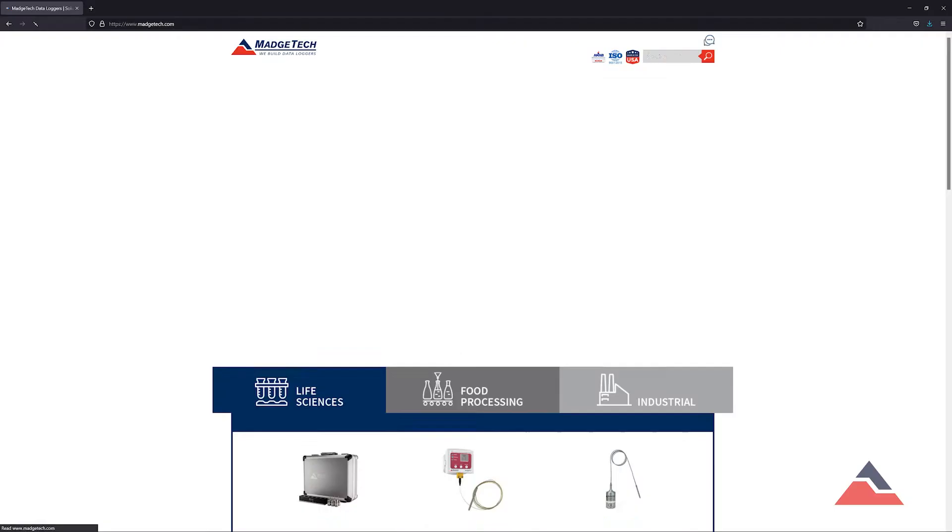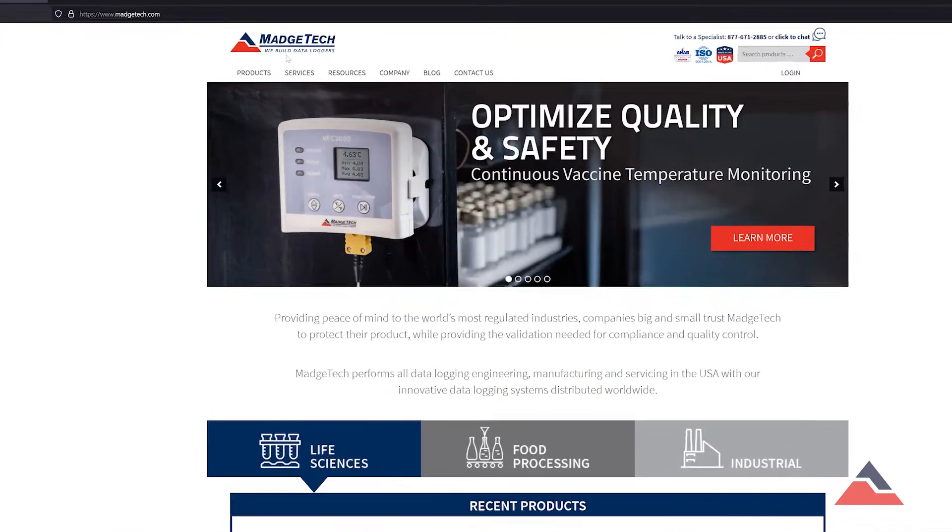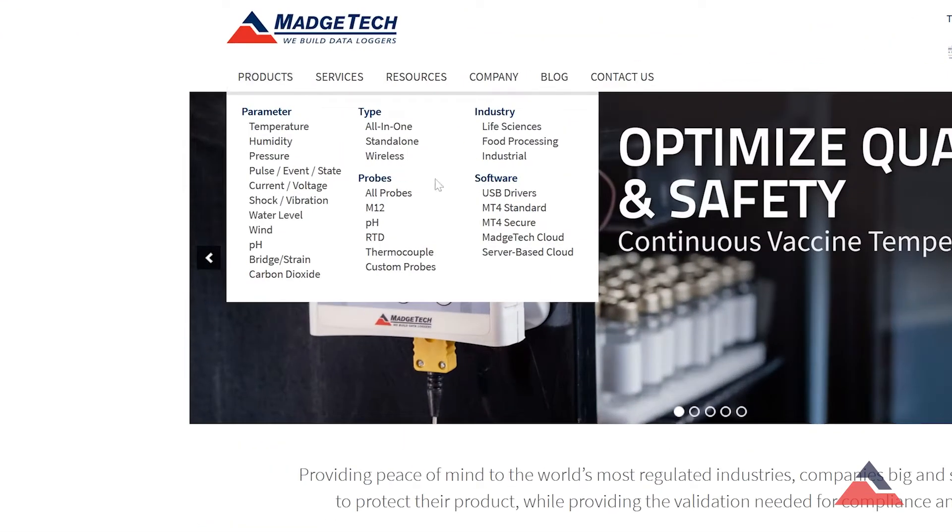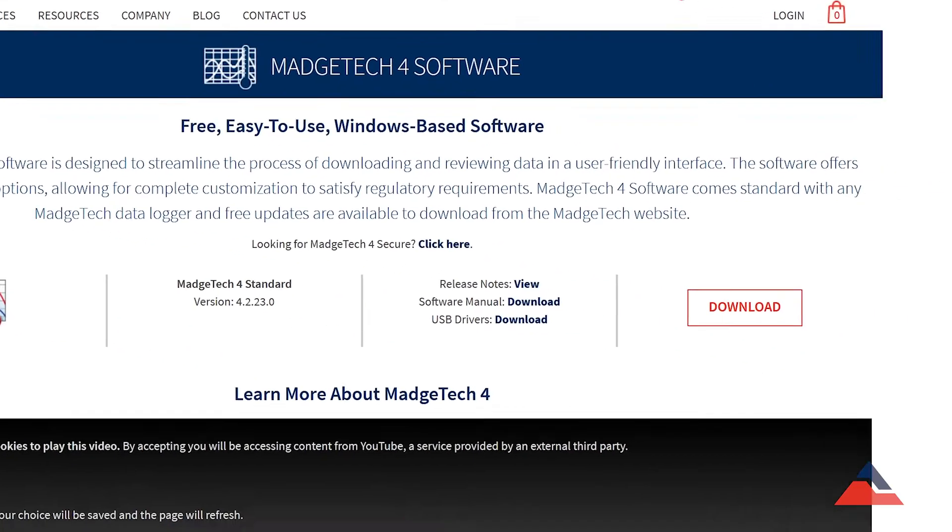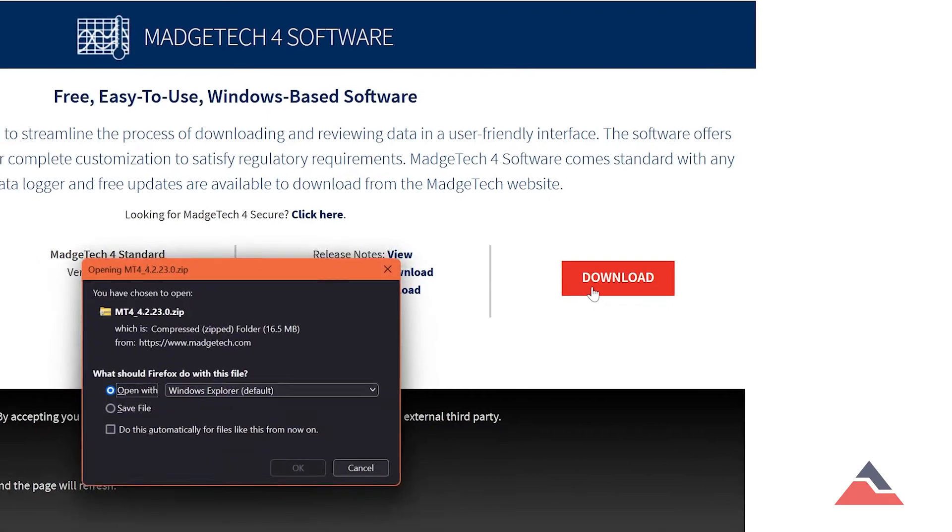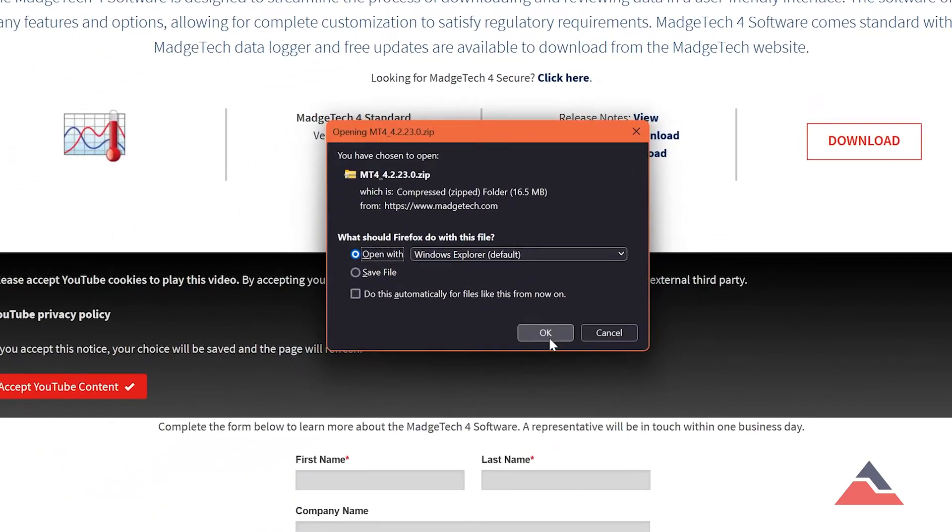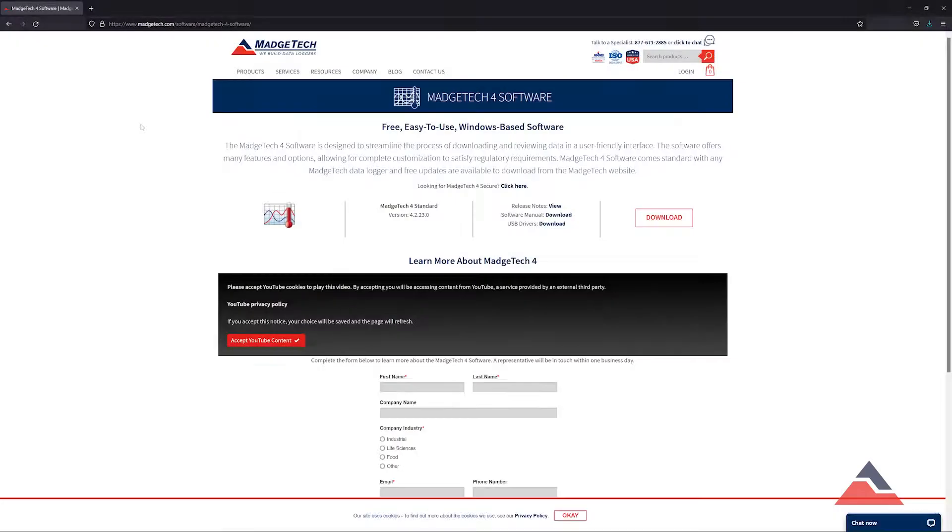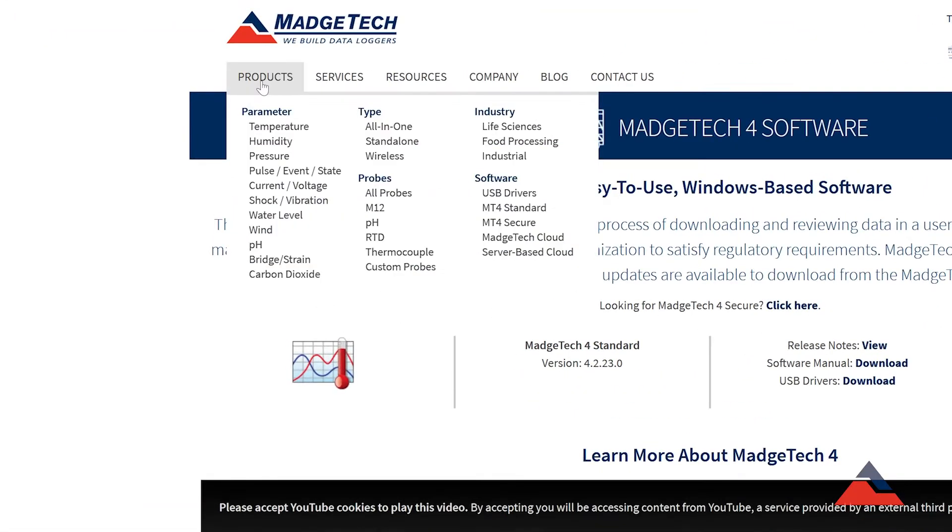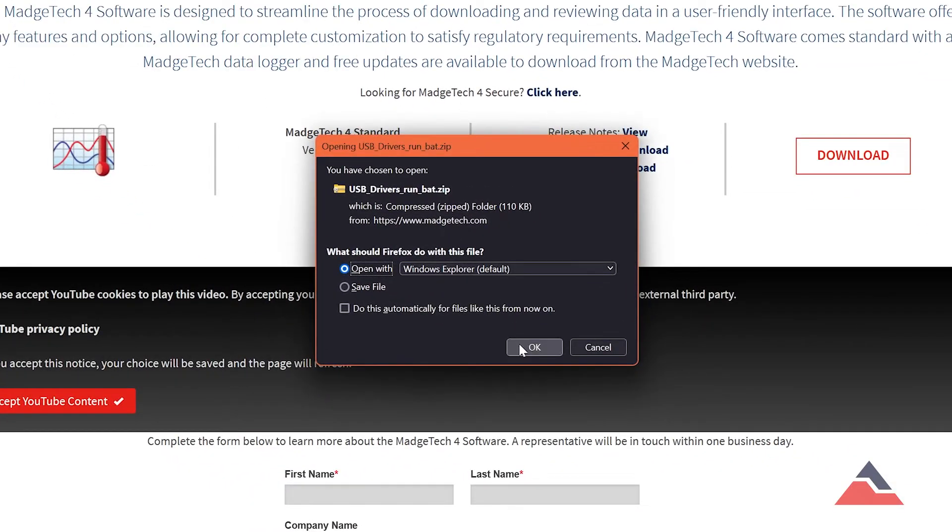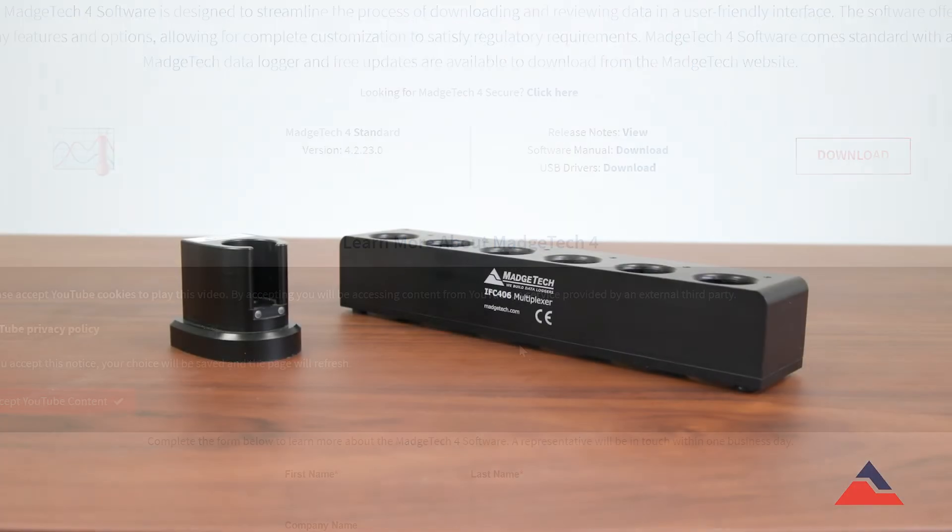Always begin by installing the latest version of the MAGTECH software from MAGTECH.com. You may also find the link on the product page or in the video description. Additionally, the drivers for the interface cable will also need to be installed and can also be found on MAGTECH.com.